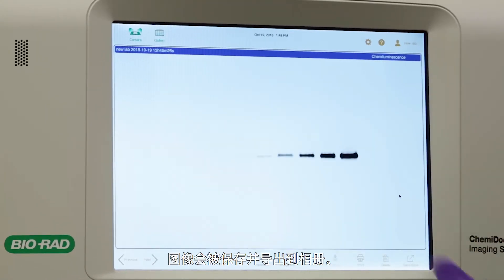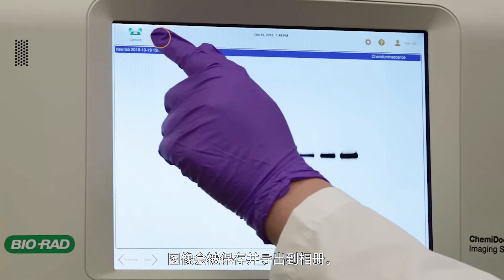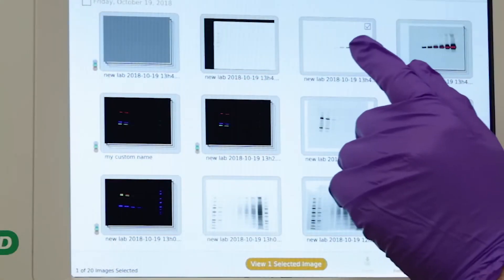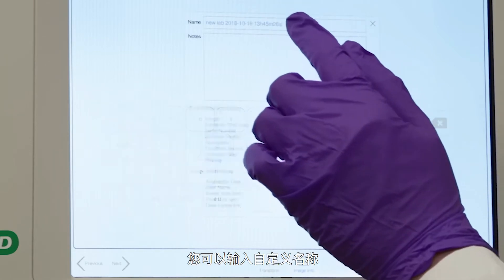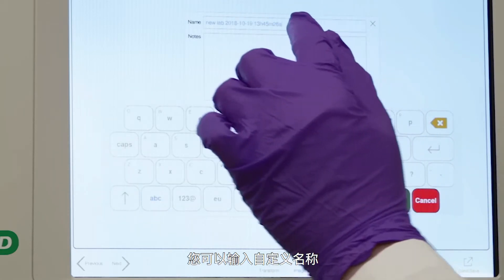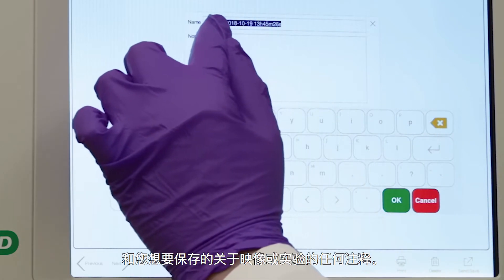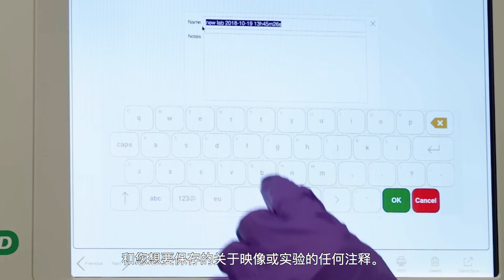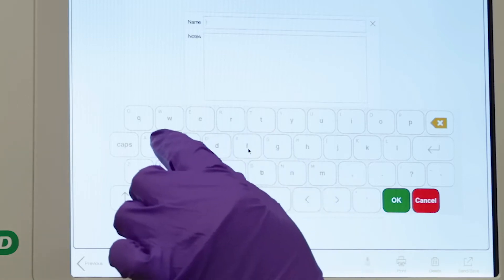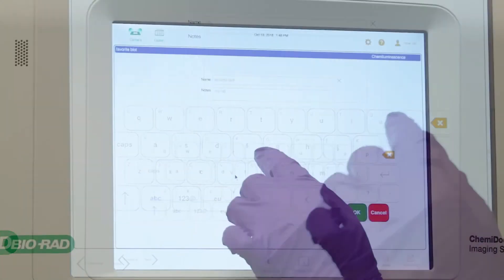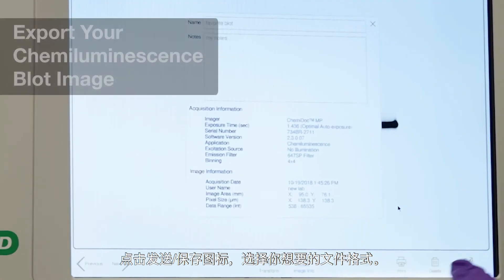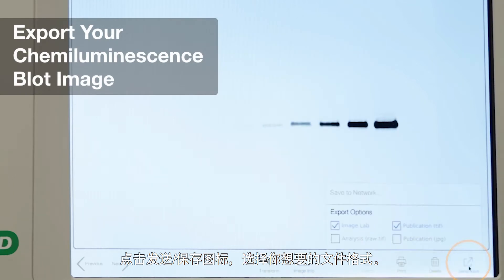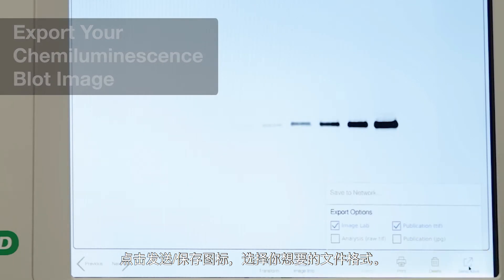Your images will be saved and exported to the gallery. Tap the Image Info icon — you can enter a custom name and any notes you want to save about your image or experiment.